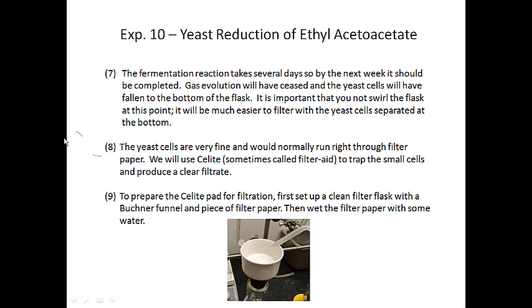So the fermentation reaction will take several days, so by the next week it'll be completed. The gas evolution will have ceased, and basically the foaminess will be gone. The yeast cells should have fallen to the bottom of the flask. So when you look at your flask again, you'll see that all the yeast stuff is at the bottom of the flask, and the top is relatively clear. It might have a slight yellow color to it, but it won't be cloudy and foamy like it was the previous week.